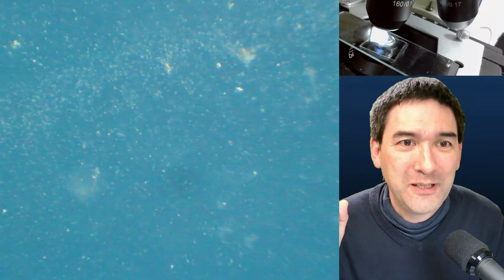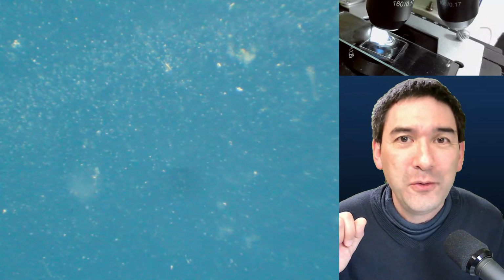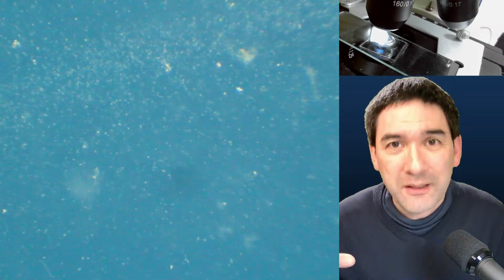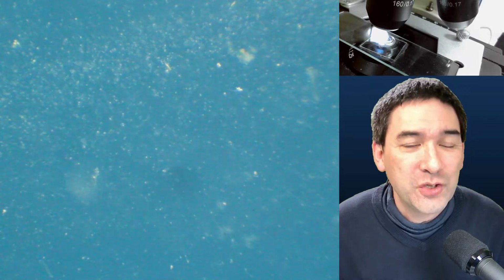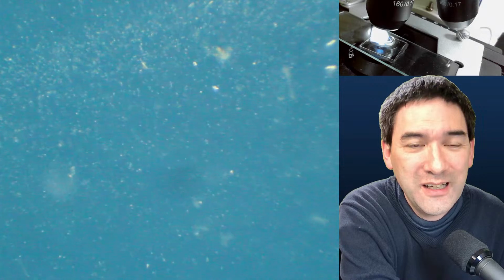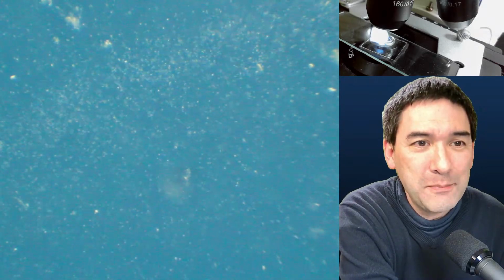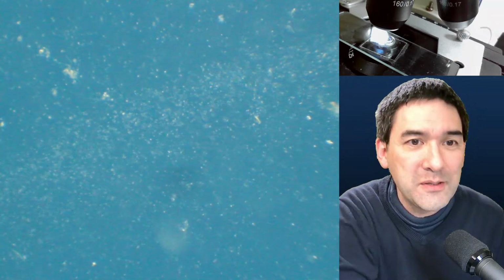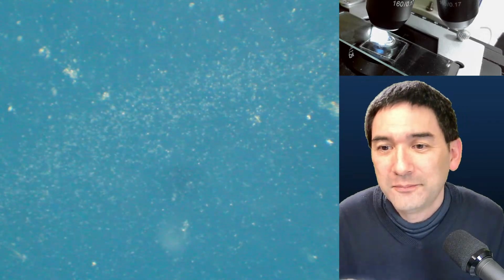In other words, right? For those of you who are a little bit into astronomy, if you put a telescope to a star, and if you really magnify it, you're also going to see a disk, but that's a so-called Airy disk. It's just a diffraction pattern, but it's not really the size of the actual star that you see. Yeah? So I've gone a little bit technical right now. But that basically explains, hopefully, why even with 10 times magnification, you're able to see bacteria. Yeah? Okay.